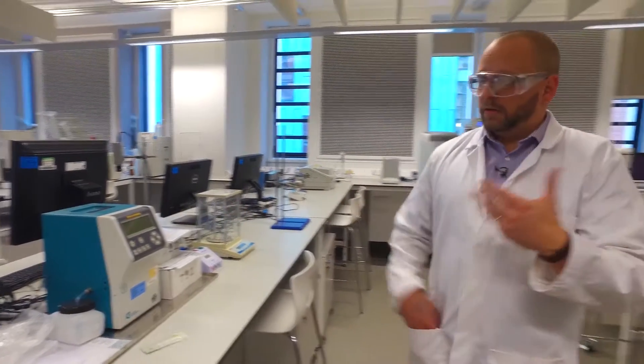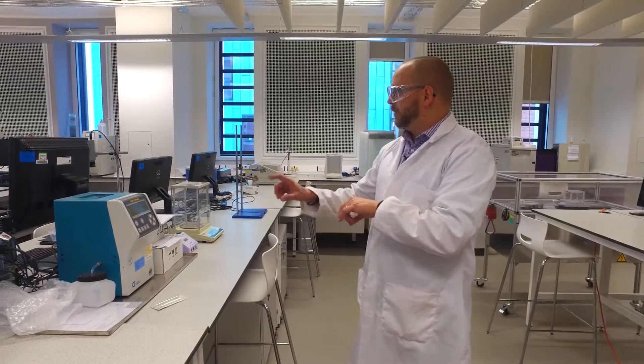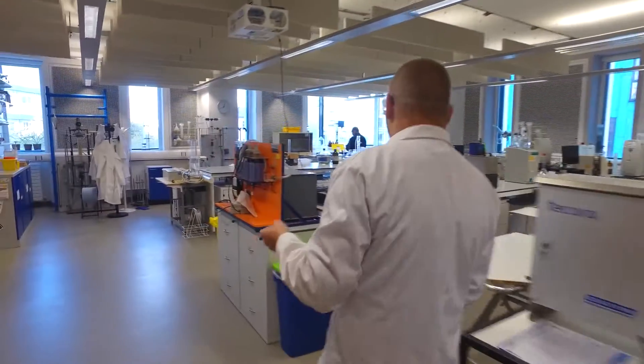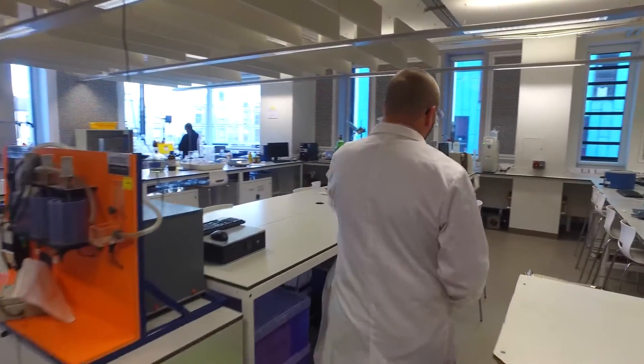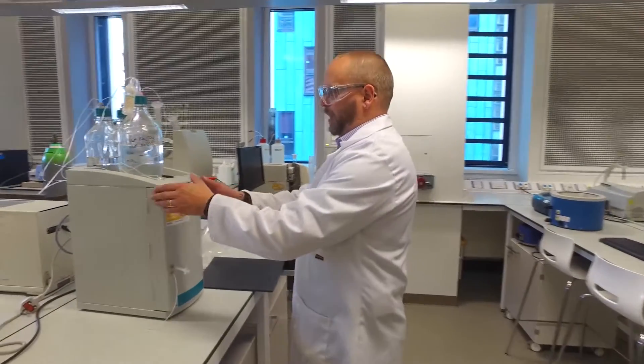That's one particular aspect we can look at. Another aspect over here as we move to it is if you're looking at the environmental aspect, we have two units. This is an ion chromatograph.